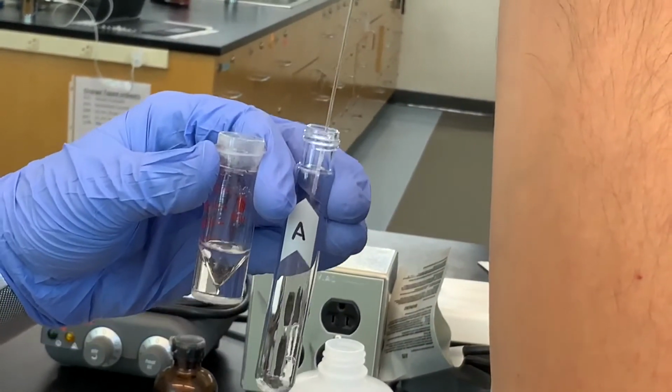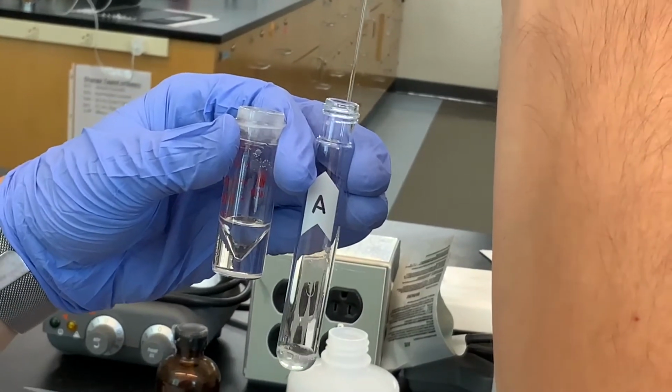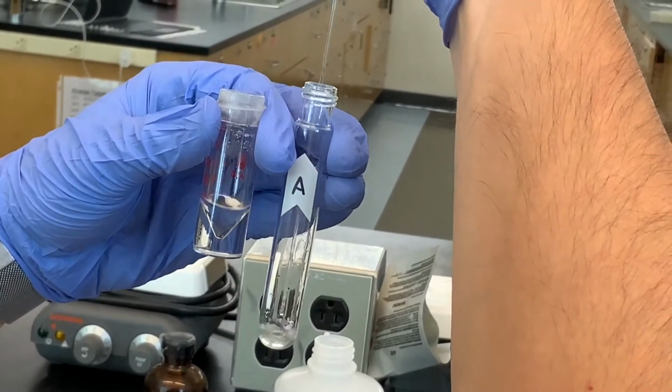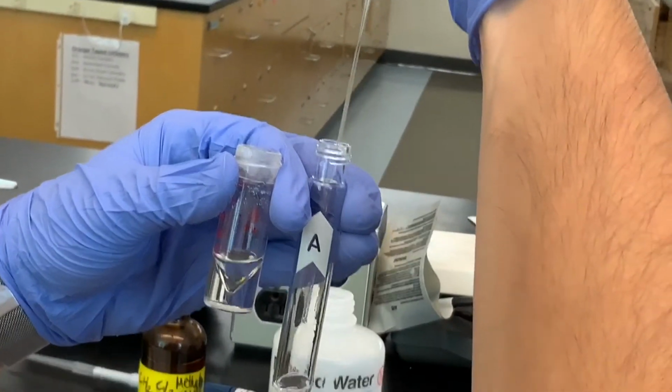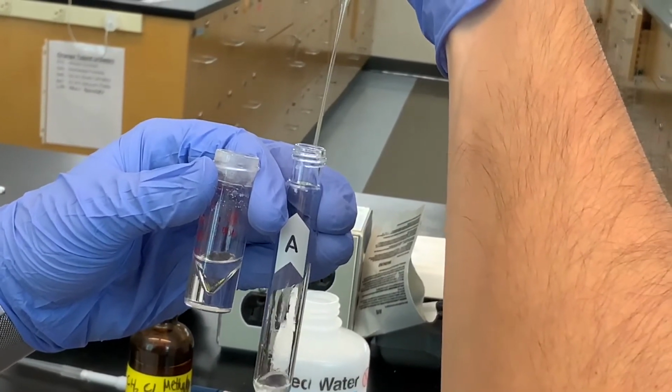And then I very carefully transfer it over, oops, to the second culture tube A.